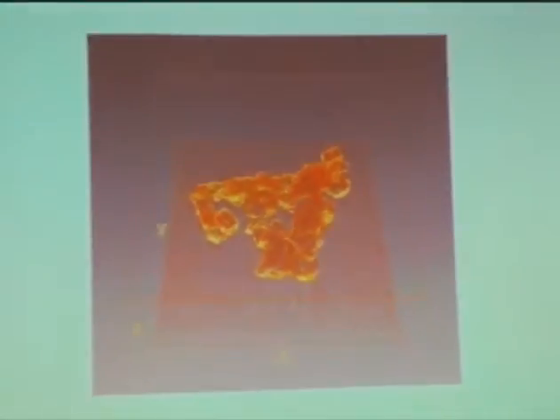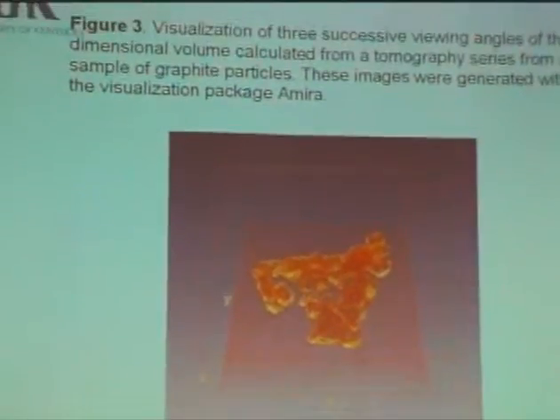This is part of the file that is generated. Here's Alan Dozier in the back of the room. Alan, do you have any comments about how they did this? Well, the trick to the new system is the computer control over the microscope, and how the stage is completely controlled by the computer. Before, all that had to be done manually, and it would take hours and hours. Now with the computerization, it becomes a practical reality. Okay, so that was a very short answer. Thank you. Yeah, that's good.